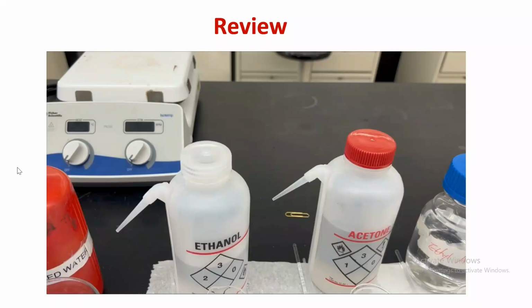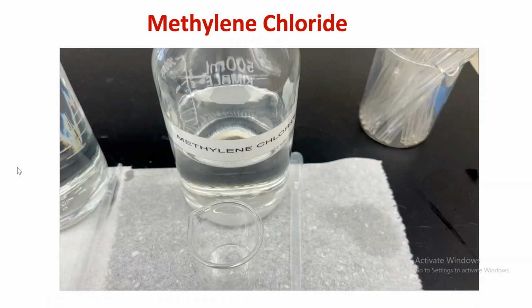So before we go to the review slide, methylene chloride, two layers, which means that it is immiscible, and methylene chloride stayed at the bottom of the beaker, so it was the bottom layer. And since it was the bottom layer, we say it is more dense. Methylene chloride is denser than water. So now you should have all the data for tables 1, 2, and 3 to complete.